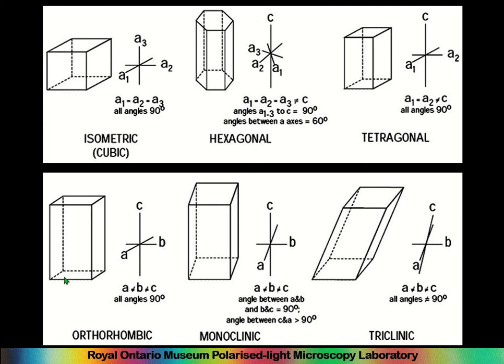And in that case, it's a matter of, does it disappear, extinguish, go extinct, parallel to the crosshairs down the microscope? Imagine there'd be like these crosshairs in the microscope. Or does it extinguish at an angle? And so that, again, is a very important distinction between different types of minerals.